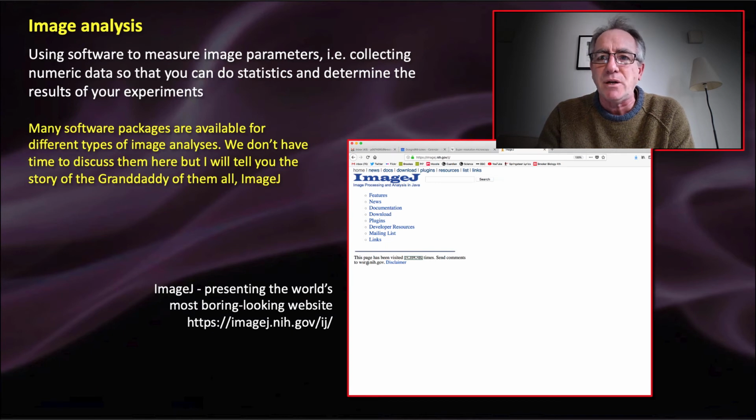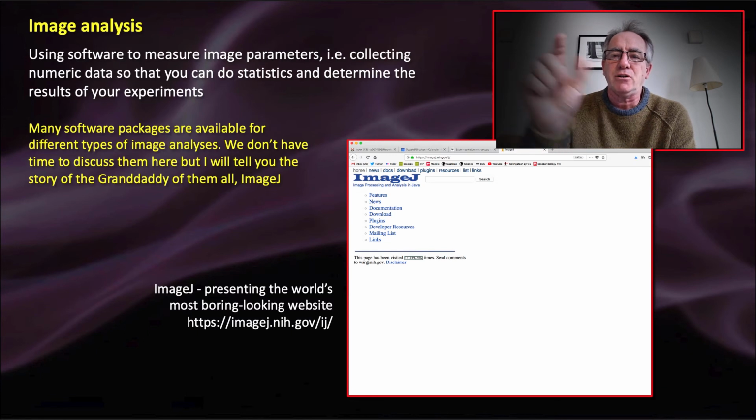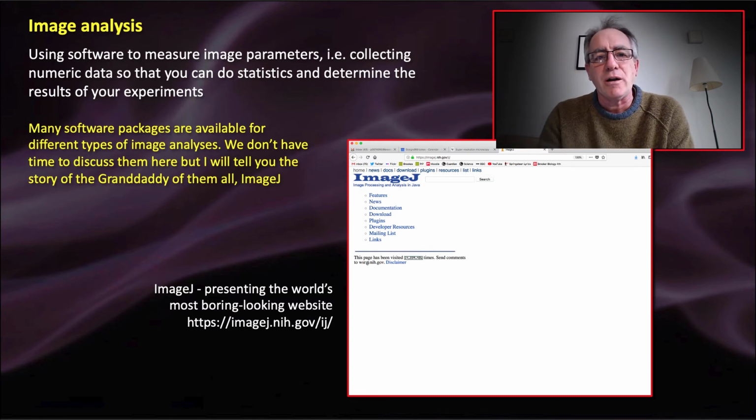And he said, what would be great is if I could draw a line in the X-ray image, and it would tell me how long that line was in real life. And so this was the genesis of this program. So he made the program and he wrote it in what is nowadays considered a very old-timey computer programming language, and he got it working.